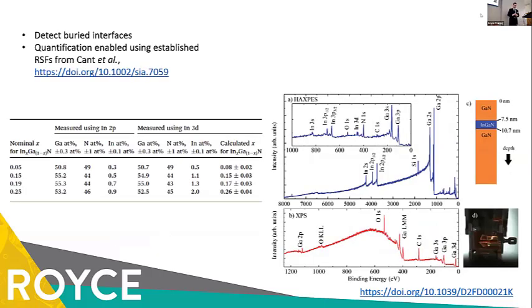We can detect buried interfaces. So we've also already mentioned gallium nitride today, just because it's a nice example that it's difficult with aluminium K-alpha for XPS to measure the nitrogen 1s peak, because it's disturbed by the gallium Augers. So we can detect in this case the indium in a thin InGaN layer buried in gallium nitride.